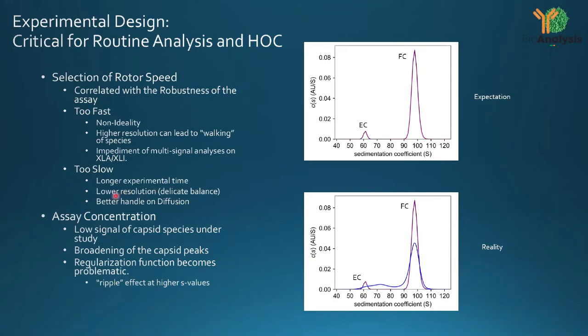Now, when you spin fast, you want to improve the resolution, but sometimes improving the resolution doesn't always improve the fit. And this is when you have low species in there. So very careful attention has to be paid.